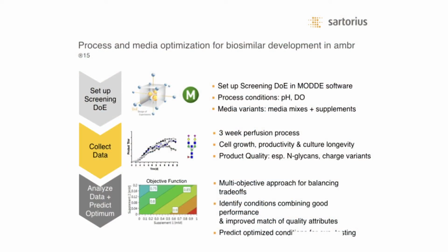So I'm just looking at a design of experiments that we did for a biosimilar development product in an Ambr platform, where we did a design of experiments for screening, followed by a multi-week perfusion process where we looked at things like the cell growth profile, feeding strategies, and also profiling of glycan profiling and charge variants, etc.